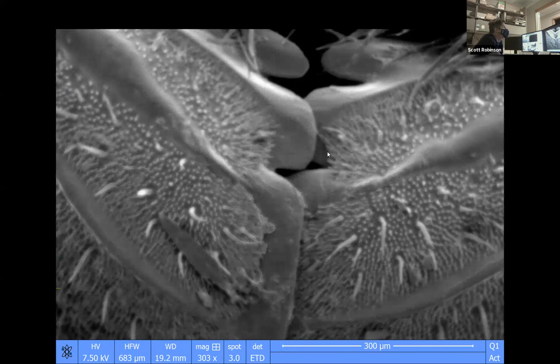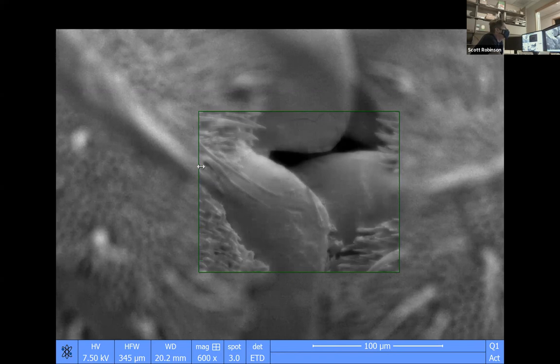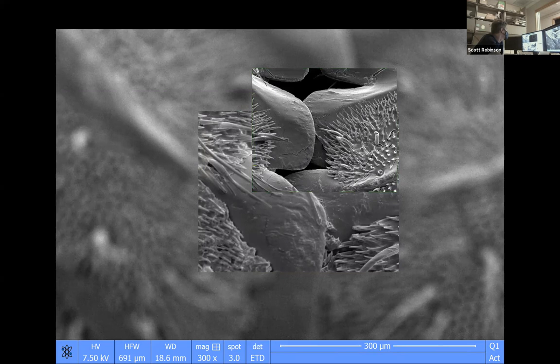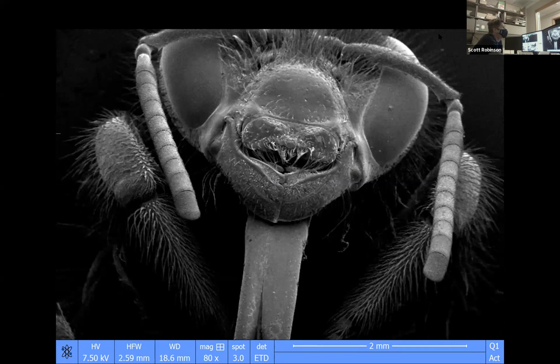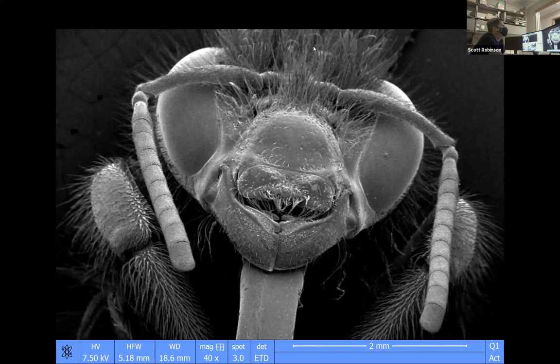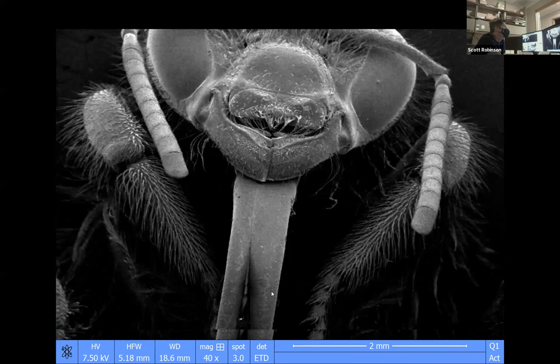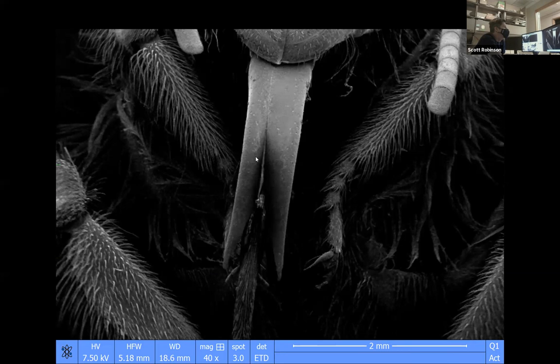Now I've got it out of focus, so pull the focus in a little bit. You can see that one of these is chipped a little bit, or it may have some fluid on it, and the fluid is dry, more likely. So this is the totally coolest bee. You can see its compound eyes on either side. If it didn't have so much hair on the top of its head, we would see also the ocelli. There will be three ocelli on the top of its head that are more like simple eyes. What we see now is the labrum that's wrapped around the glossa, and the glossa is the tongue.